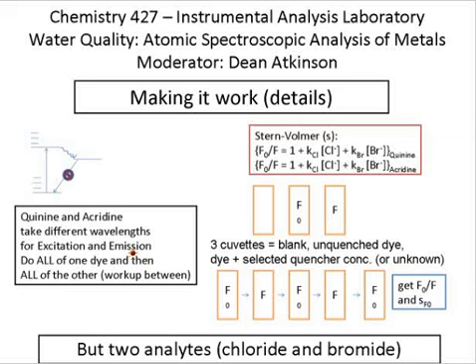Even within that, though, there's one other trick that we suggest: the actual stability of the instrument is not that great. In other words, if you had to measure these F and F naughts over the course of a day, you would have trouble. But in fact, what you have to measure is the F and F naught of a sample with a different quencher in it, but the F naught can always be measured.